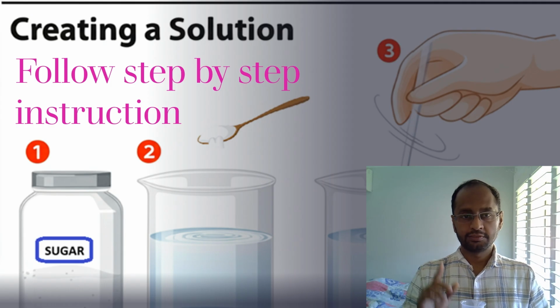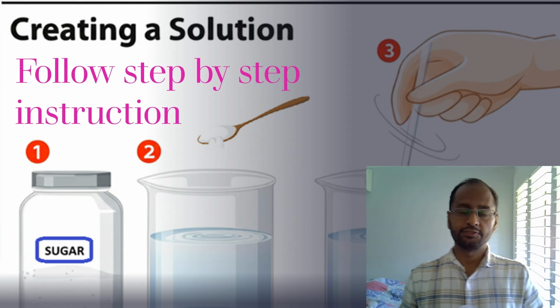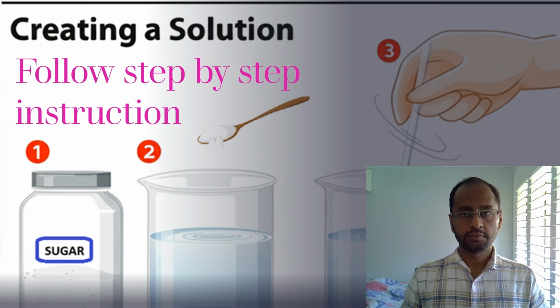But before we start, safety first. Put on your safety gear, goggles, and gloves. If the safety look isn't for you, the rest of the lab isn't going to happen for you. Seriously, no safety, no experiment. Can you all give me a thumbs up if that's clear?